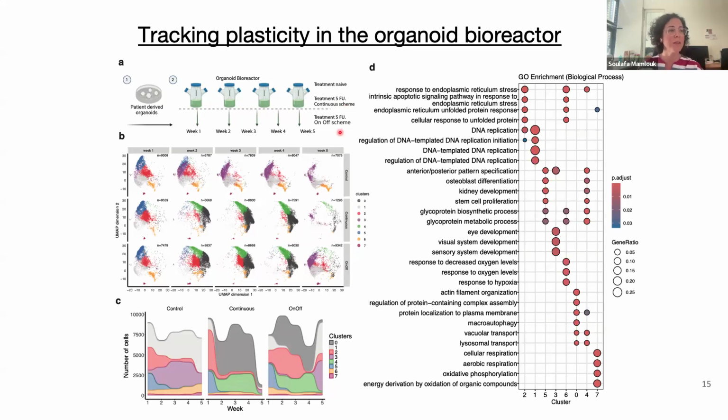So these are also liver metastases, and we push them into becoming what would be like a relapse or resistance. And we look at the single cell RNA and try to use this information from their clusters to inform us about how they change over time and what this would mean. So for example, this gray cluster that comes up after continuous treatment and dives down, we ask, okay, well, what patterns or important pathways are they connected to?